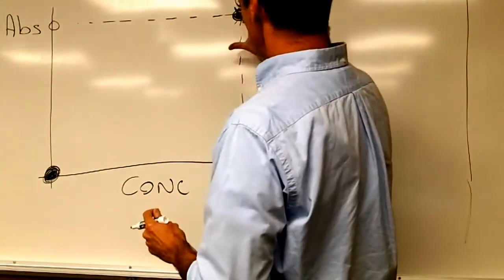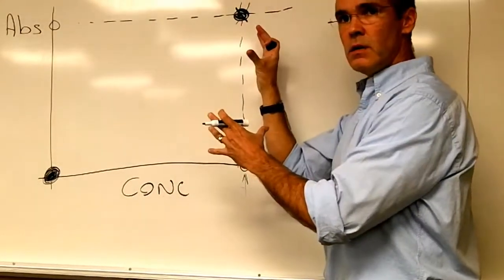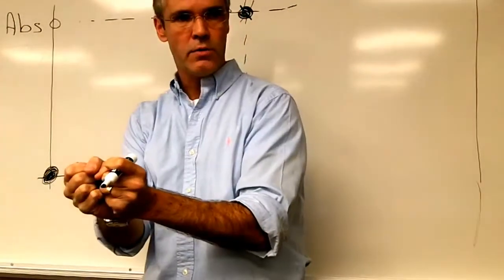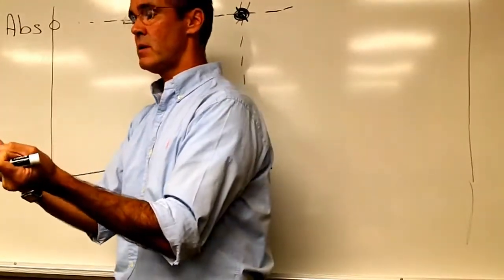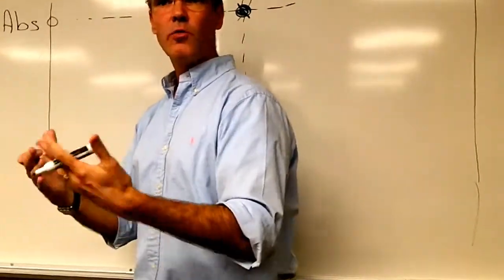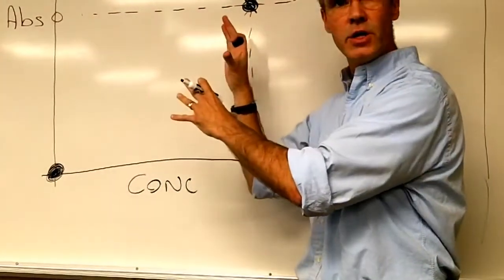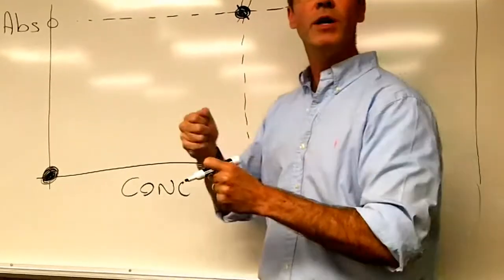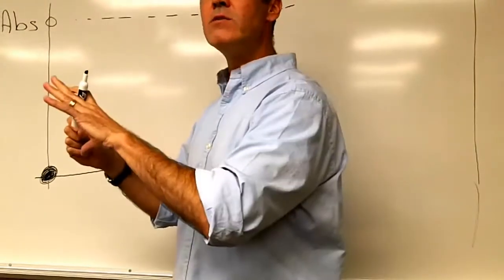So here, we want to have something that is significant, but maybe not too concentrated compared with what we see in our unknown. It's very, very green, and the unknown is very, very diluted. So maybe you don't really want to use this point and have something that's really, really high in concentration. Maybe you want to dilute that highest, the most concentrated point. Maybe you want to dilute it a little bit, right? And get as close as you can.